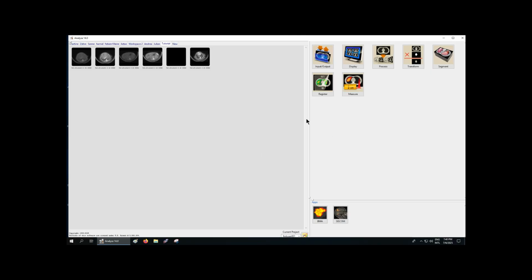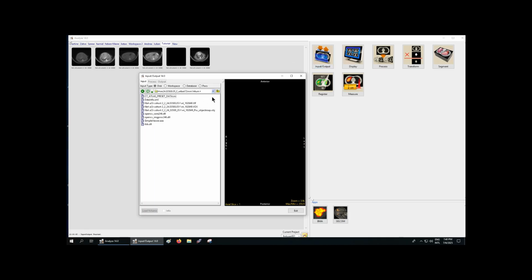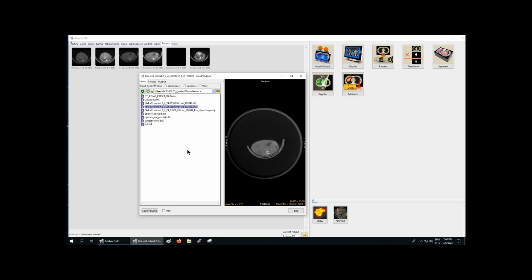A clear difference between this video and the previous video is this video will make use of files that have not been subregioned, which is a very important distinction, and it also makes the process quite easier. For that, we'll be loading in all the files again.